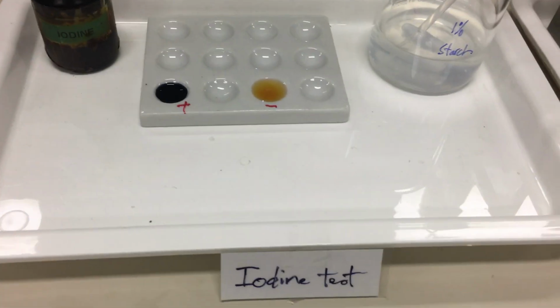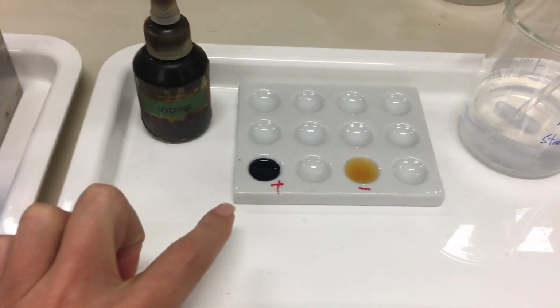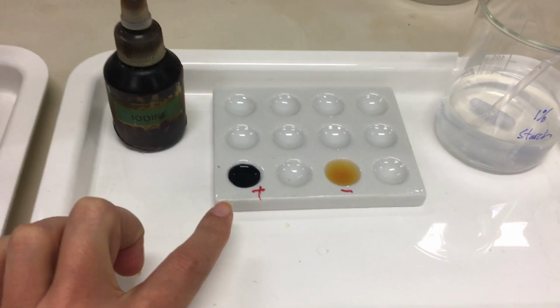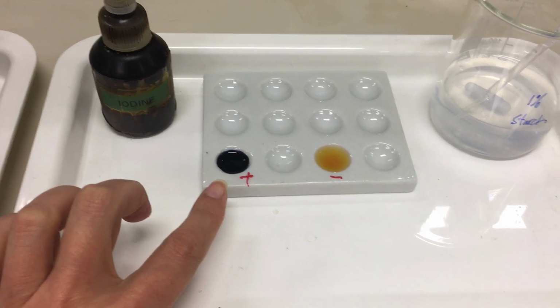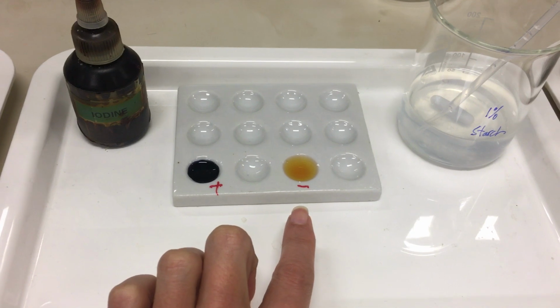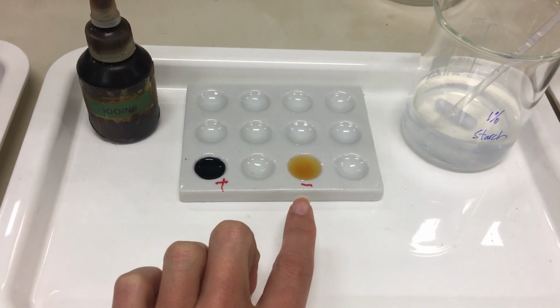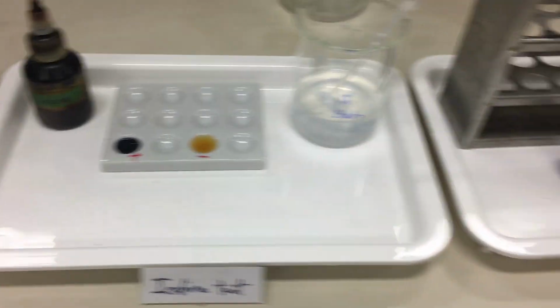If after working with the iodine test your unknown sample becomes blue after adding the iodine, that means that your sample includes starch. If after adding iodine it remains yellow, that means that your sample doesn't have starch.